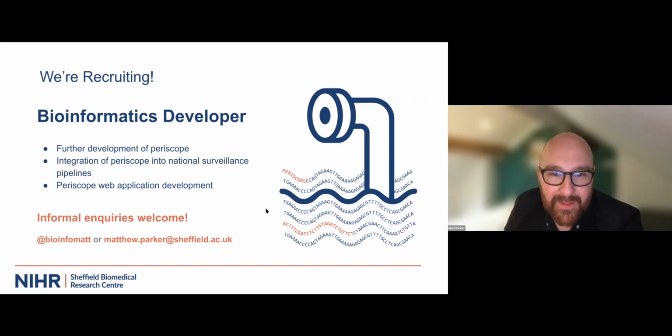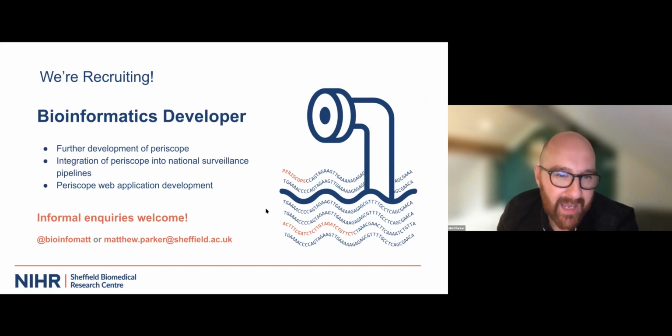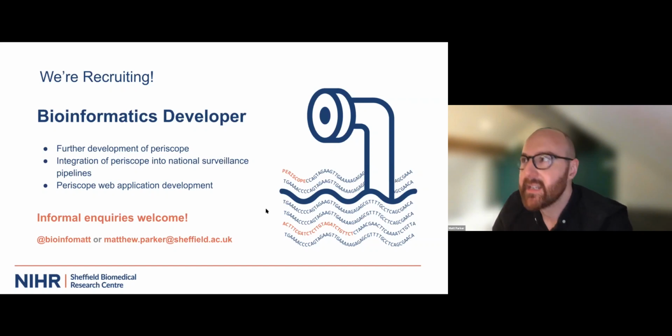I think the killer paper is all the VOCs together, right? And if we'd had that data locally, we would have done that. So we're trying to collaborate with people. The problem is we're sequencing our runs for 24 hours, so we get a reasonable amount of reads, and we show in the Periscope paper that below 50,000 reads you start to see really not very good performance of this kind of analysis, because you don't get enough subgenomic RNA reads. I should have really said that you're talking around 1% of the total that is subgenomic.